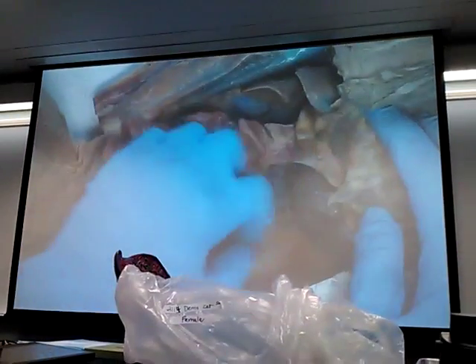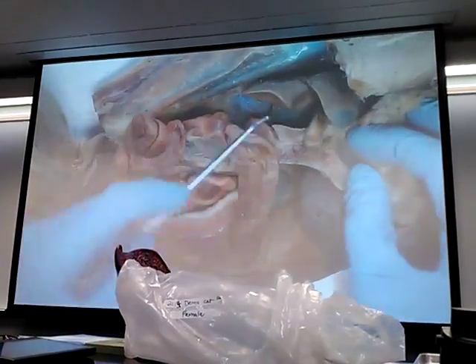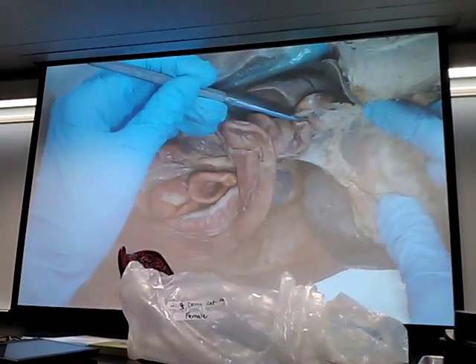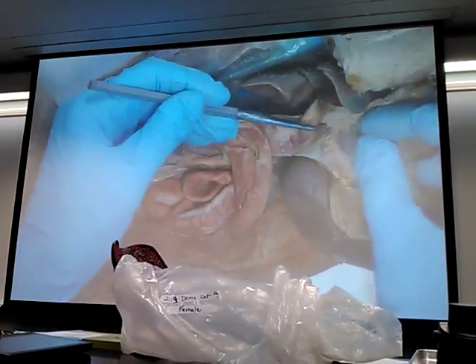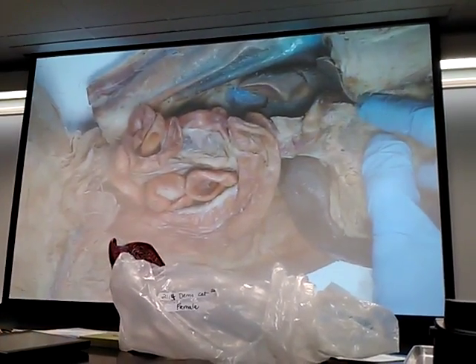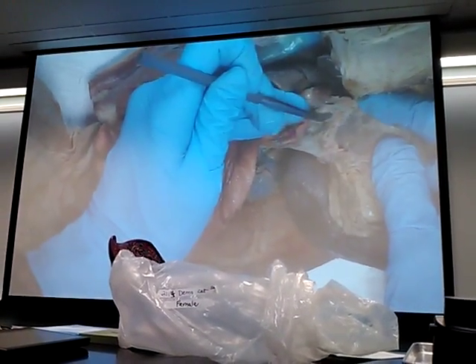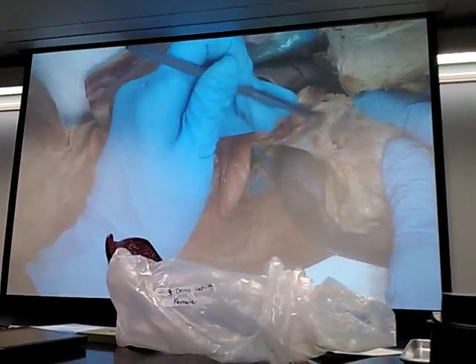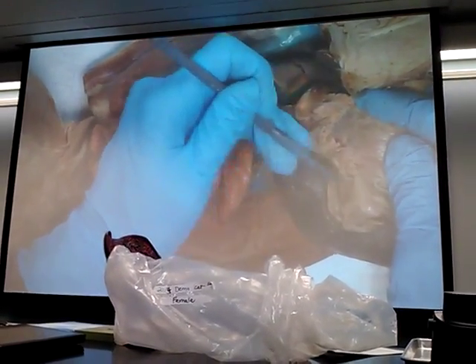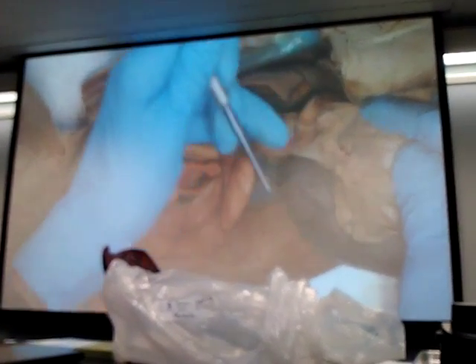And on the underside of that greater omentum, kind of right underneath the stomach, is the pancreas. And this kitty cat has a pretty minimal pancreas. It doesn't have a clear border like a lot of the other organs in the abdominal pelvic cavity. But this is the pancreas right here and right here. My cat has a pretty small pancreas.